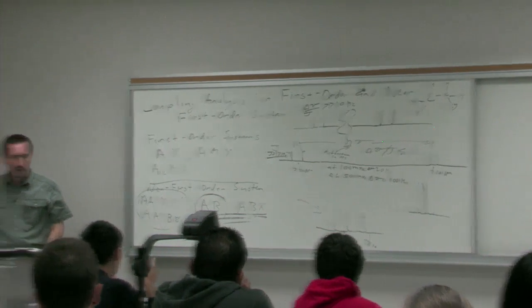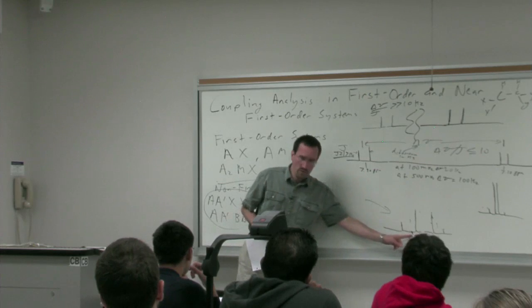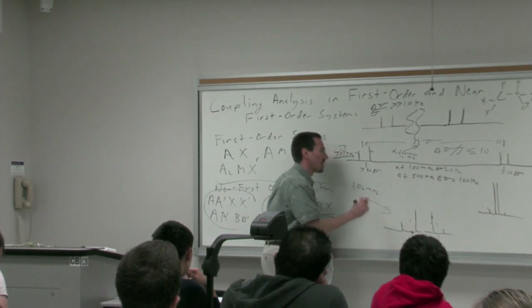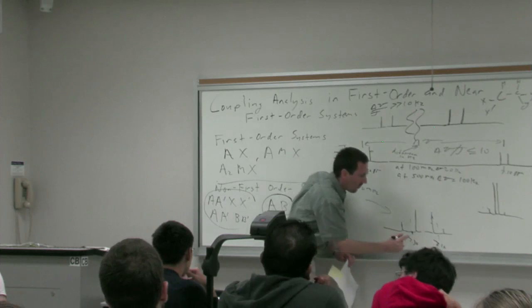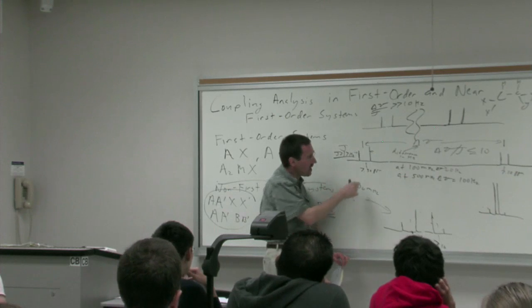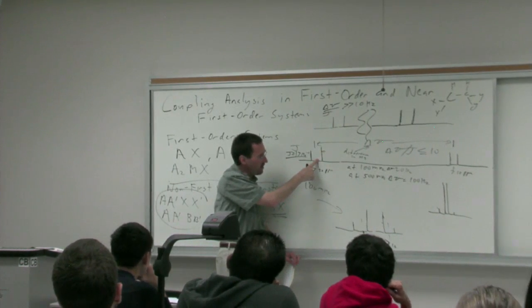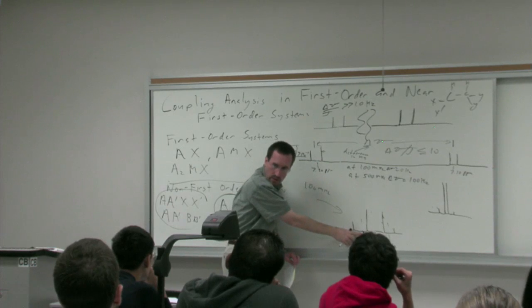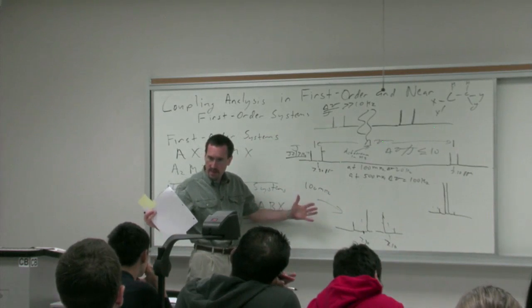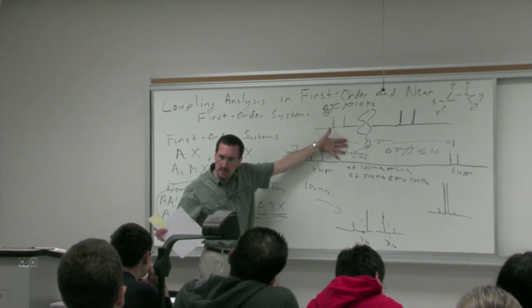Well, the center moves if you improve the equipment? Will the center move? So here we've gone from our 100 megahertz to our 500 megahertz. The point is the center of this peak for this hypothetical compound is always at 7.3 ppm, whether I'm at 500 megahertz or at 100 megahertz. But the distance between the peaks, because the number of hertz per ppm is much smaller at 100 than at 500, is very small here.